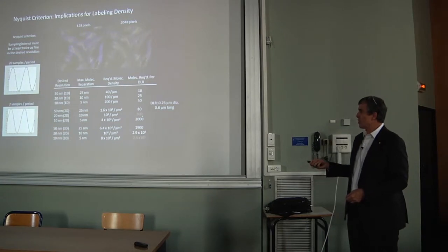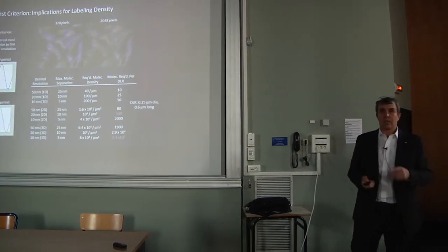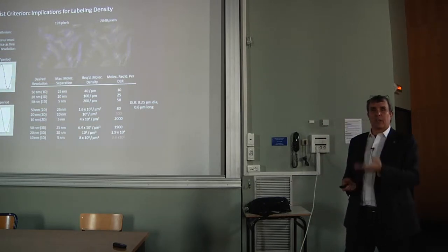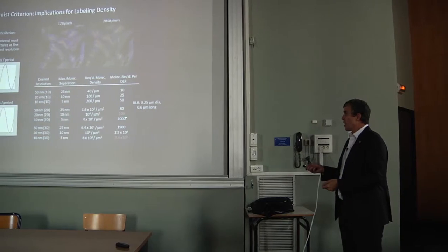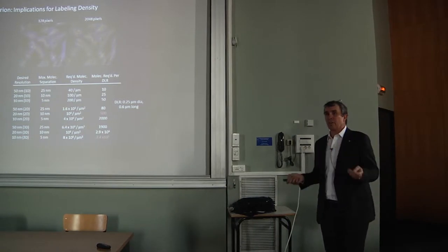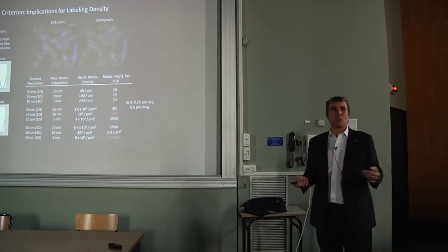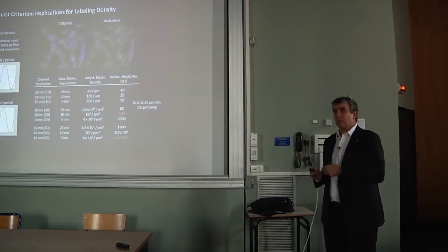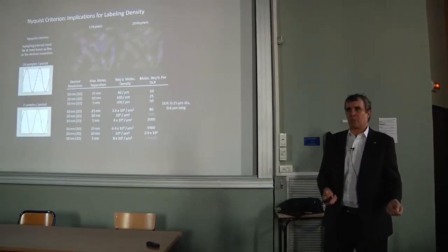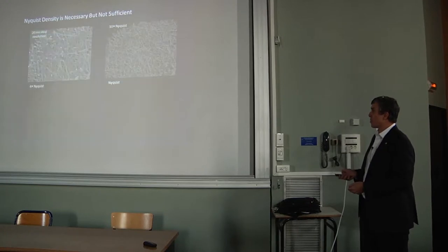So if I want 20 nanometer resolution in a diffraction limited spot, that would mean I'd have 500 fluorescent molecules. And I need to be able to see one on top of that 500. That's doable with the on-off contrast ratio of fluorescent proteins. But what's hard is to get 500 in a diffraction limited spot. Because normally, when you transfect cells or otherwise label cells at the diffraction limit, you're working at much lower levels of labeling. So a lot of the onus to get these super resolution techniques to work well isn't so much on the instrument developers anymore, it's on the biologists who do the sample preparation. And it's really difficult to do that properly.